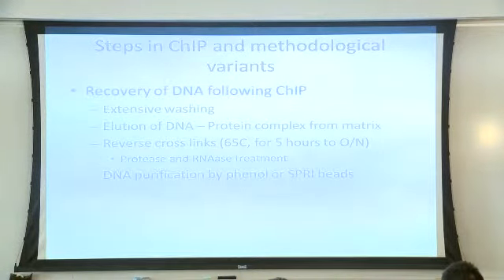Recovery of DNA following ChIP. Here, there's not so much methodological variability. One of the changes in our protocol in the last couple of years was the transition from using phenol to using SPRI beads. So we've excluded phenol as much as we can from our preparation, just because nobody likes to work with it. But I see Casey sitting there, and I know she still gets some great results with phenol.